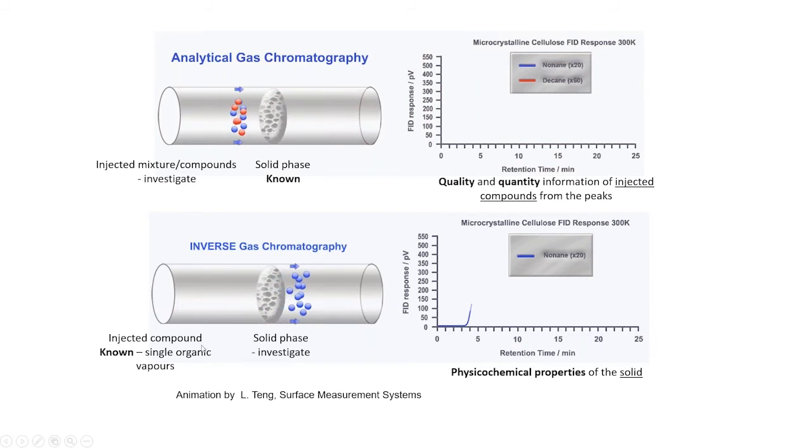So what we will do is inject this in a range of different concentrations and in a range of different dilutions, and that will change the characteristic of these retention peaks. And as these retention peaks change, we can plot our isotherms for every probe that we've injected, and we can relate these changes to differences in their physiochemical properties.